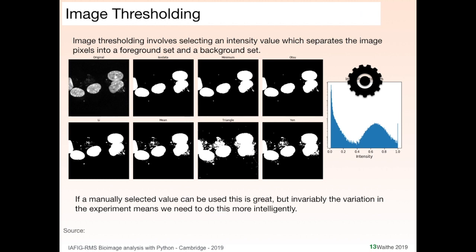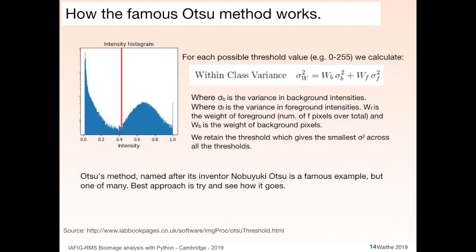So in the practical later, you'll see the Otsu algorithm. This is a very famous one. You can look up online how it works. It's very simple, but it seems to work very well. And here we've got a bit of a description of how it works.